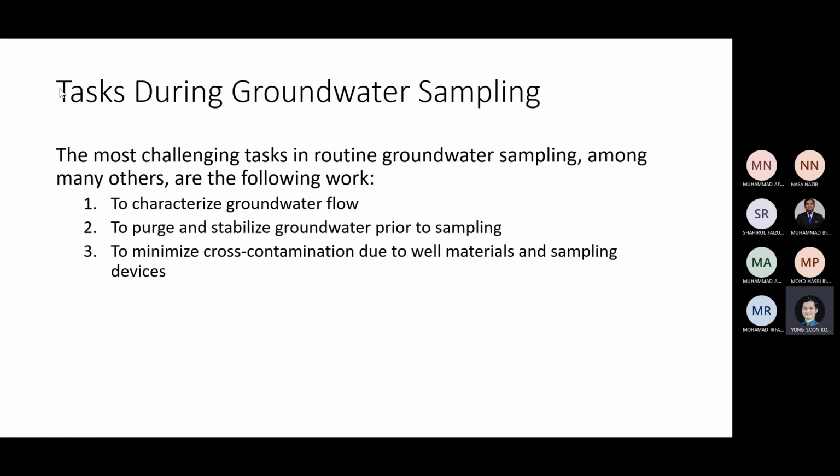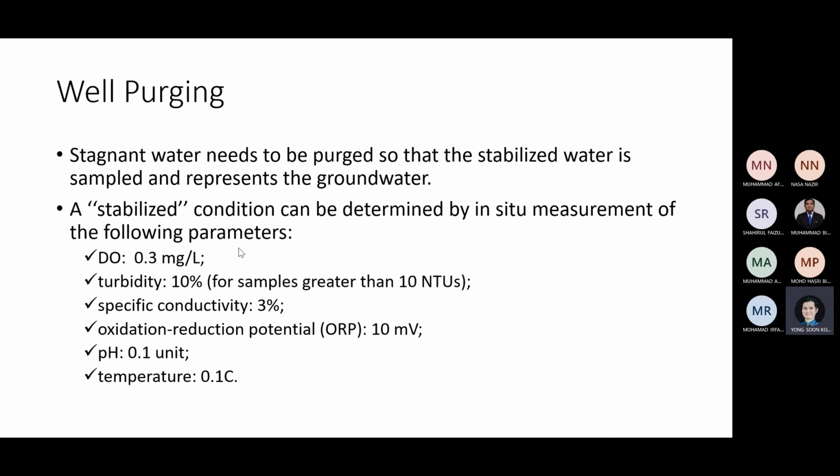These tubes are made of plastic or maybe rubber, and they degrade over time. So when they degrade, they might introduce new contaminants or analytes. So you need to remove them first. So it's a good idea. When you are flushing and purging the stainless steel tube well, you are also purging the rubber tube as well. So all tubes need to be cleaned up before an accurate water sample can be collected.